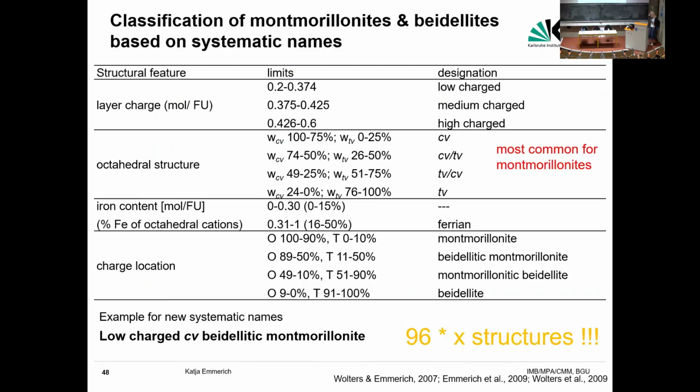And based on this, we were then able to create an unambiguous classification for the solid solution series of montmorillonite and beidellite.